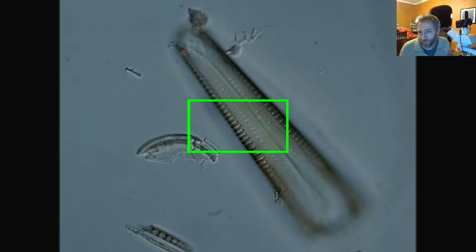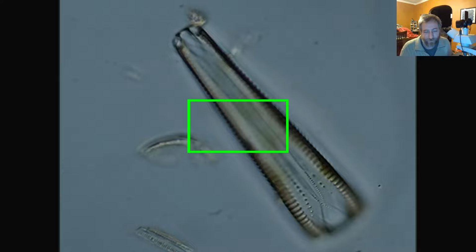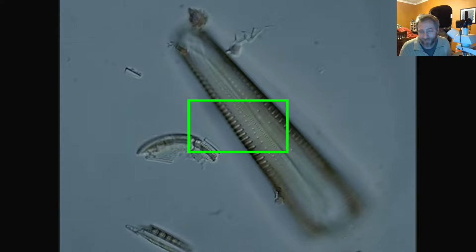They're beneficial. They create oxygen, and we need oxygen. So people tend to think that trees make all the oxygen, but in fact, diatoms make as much or more. And so they're actually very important components of the ecosystem as well. They're basically a food source for everything in aquatic ecosystems. So water bears eat them, snails eat them, fish eat them, everything eats them. They are basically the base of the food web in practically every aquatic ecosystem, including the ocean, rivers, lakes, you name it. Critical part of our aquatic ecosystems.